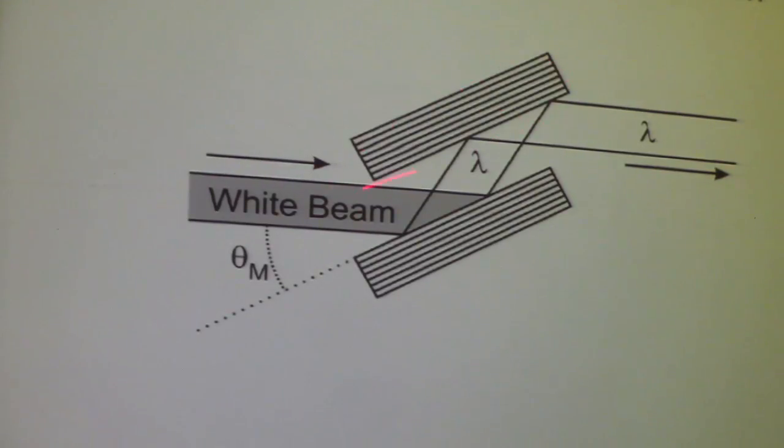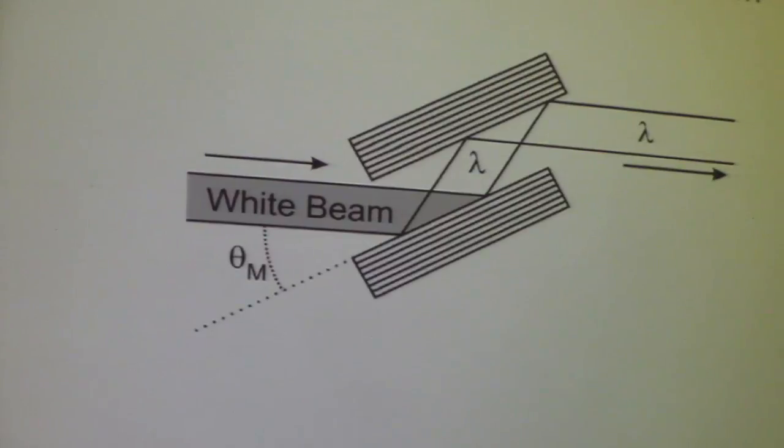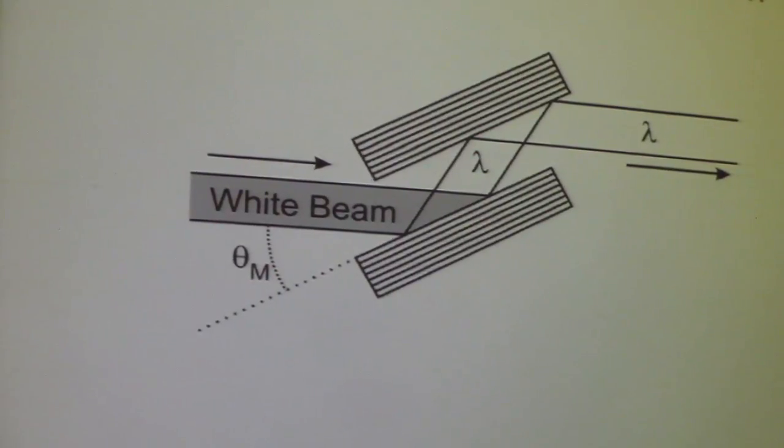But this second crystal here is also at the Bragg condition, and it's never seeing the white beam. So this crystal doesn't have a very high heat load on it, and so this one doesn't get distorted, and so the beam coming off that second crystal is much cleaner. So this double bounce monochromator was actually quite revolutionary when it was invented.